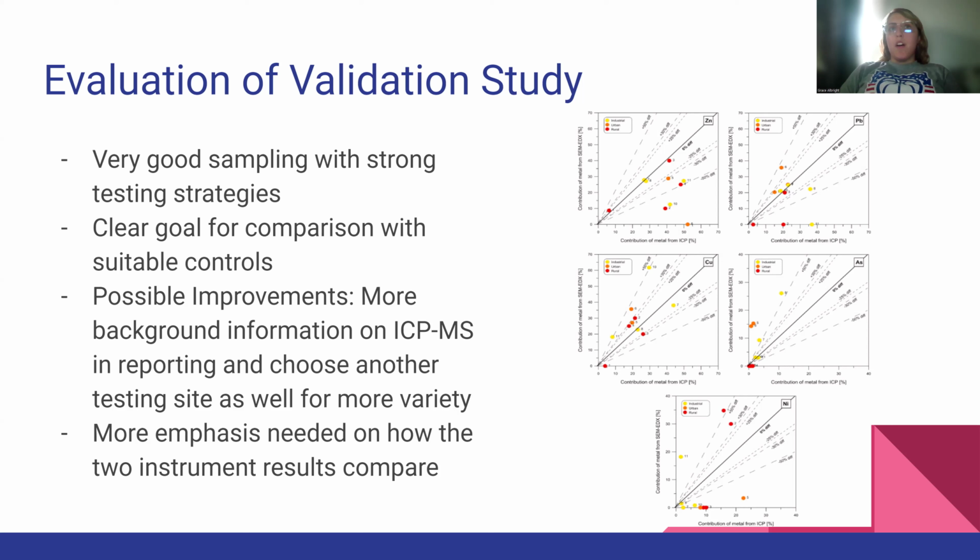Very smart, I thought, along with really aiming for, is SEM EDX effective, but also can we get the results that we're actually looking for, of is this copper smelter polluting the air and affecting the general air quality.